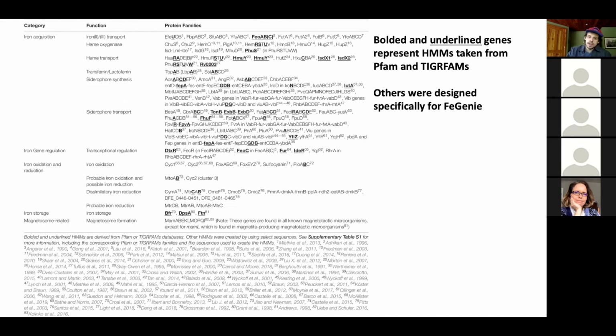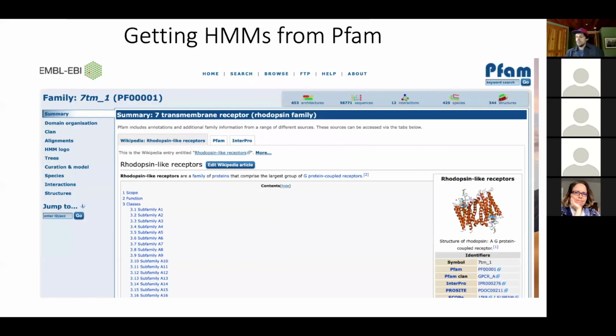And this is something that I had to figure out. I wanted to do a brief showcasing, not a tutorial, of how easy it can be. So this is the Pfam webpage. It's really easy to find. You just type in Pfam, and for me, Google auto-completes it.